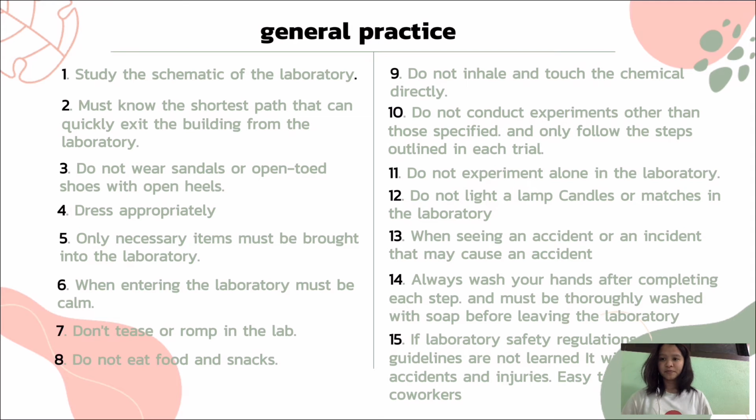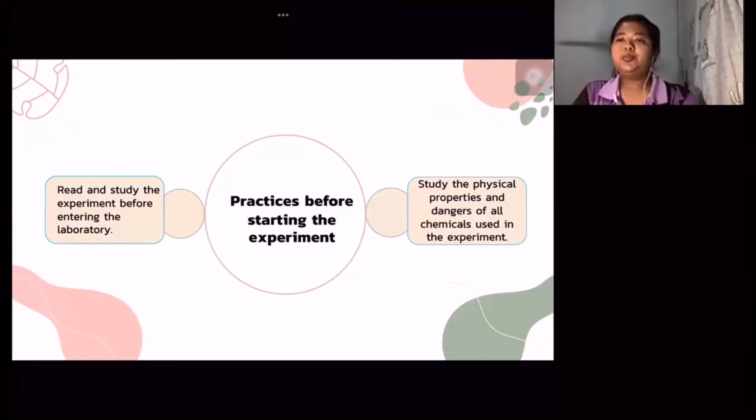Number 15. If laboratory safety regulations and guidelines are not learned, it can cause both accidents and injury. Easy to save yourself and co-workers. Practice before starting the experiment.